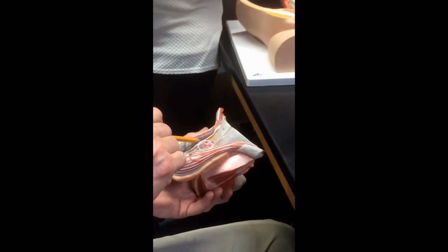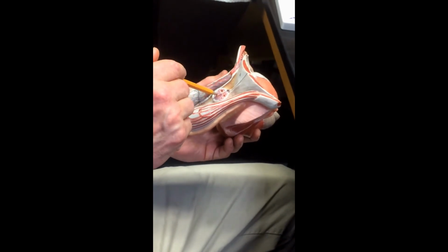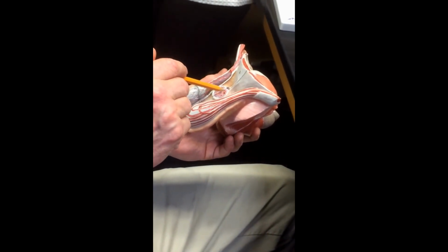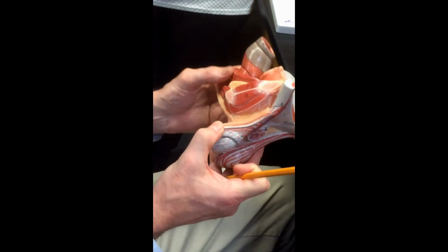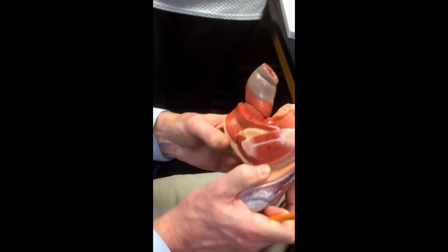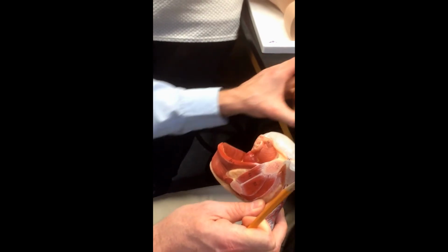What tube is that? Or what structure is that, would be a better way to look at it, not tube. There's one ventral corpus spongiosum. There are two corpora cavernosa that are dorsolateral. Let's take a look at this. It's still not that great, but this is actually a little bit better here.